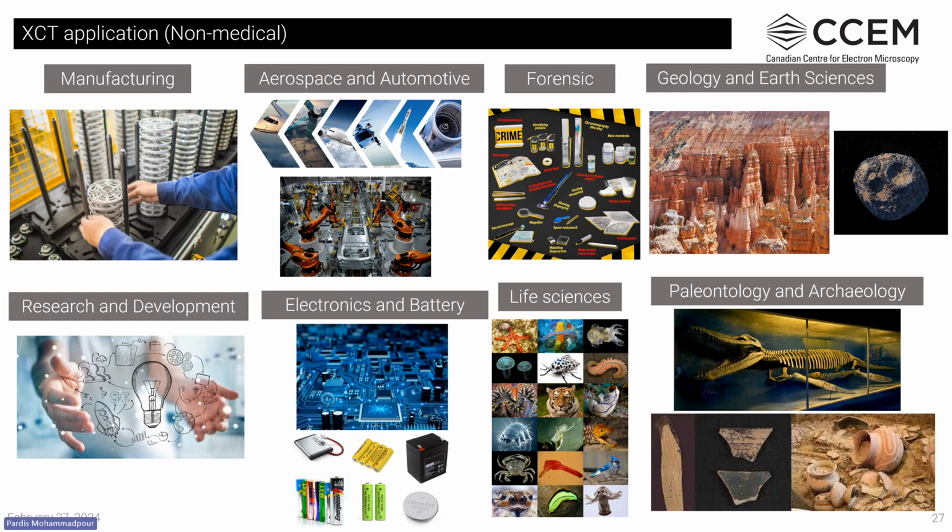It can be used in life sciences for animals and plants, for example, visualizing and studying the anatomy of small animals like mice and rats to understand disease models and treatment effects.